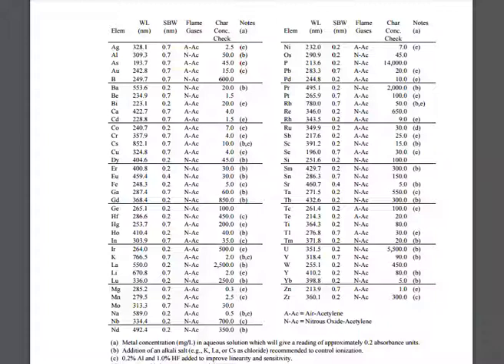Again, double check your instrument parameters. Double check your cookbook. They will always define what this characteristic concentration check should be. So, double check it, but for this cookbook, you see down here at the bottom, it's a 0.2 absorbance. For our cookbook, it's in reference to a 0.2 absorbance, and for many of them, that's how they're kind of standardly made now.